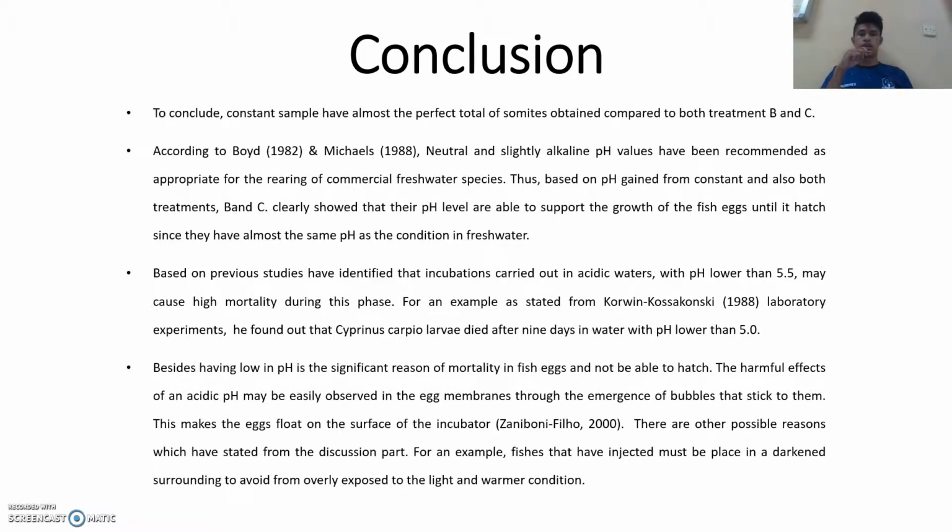So as stated in the method, the healthy, fertilized egg will float on the water while the unfertilized egg will sink to the bottom.